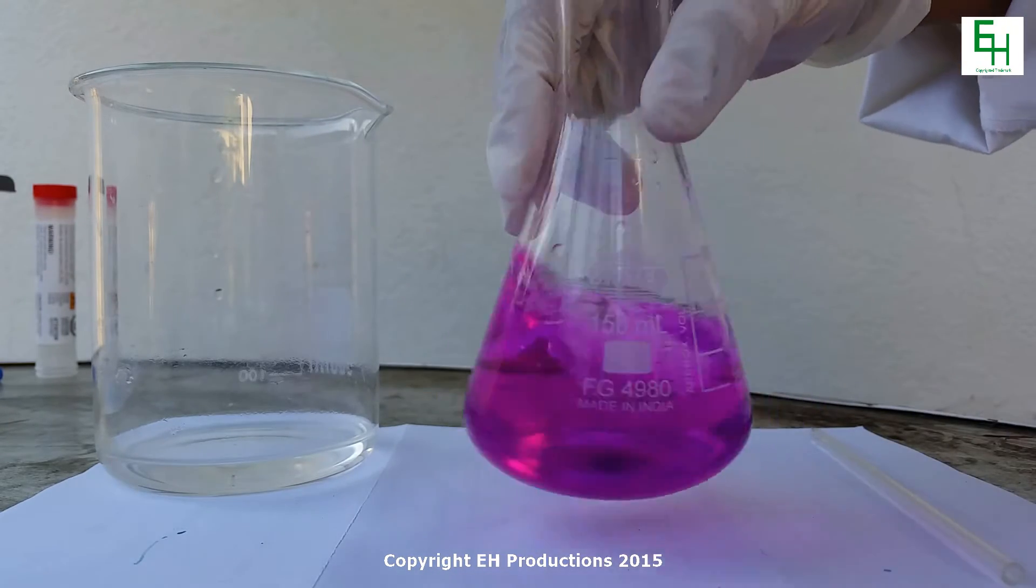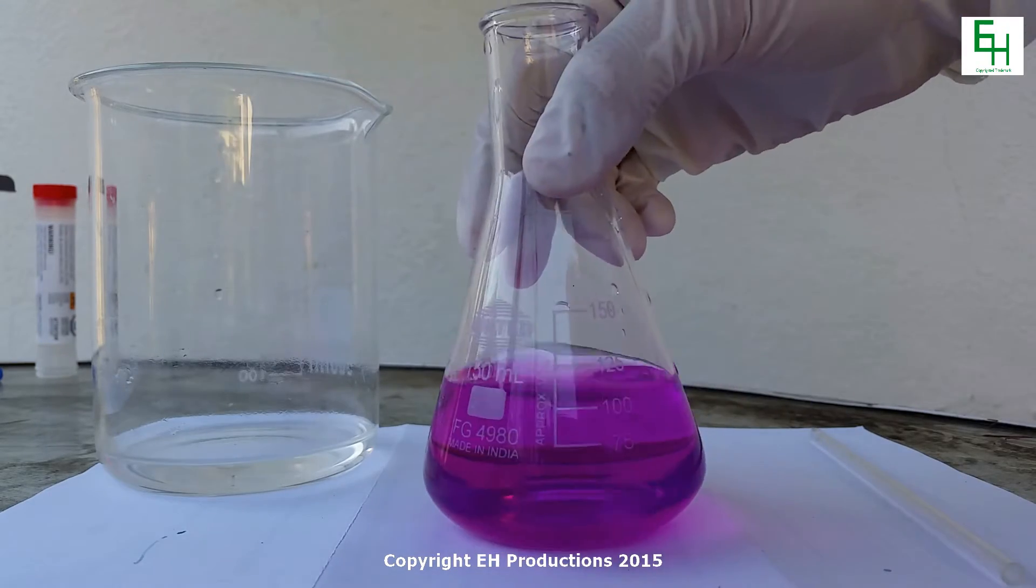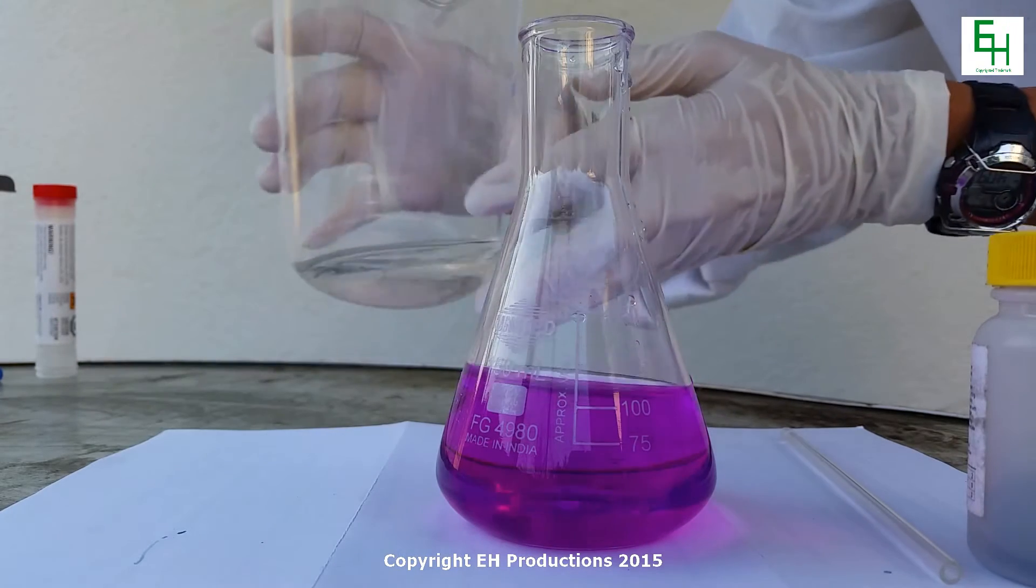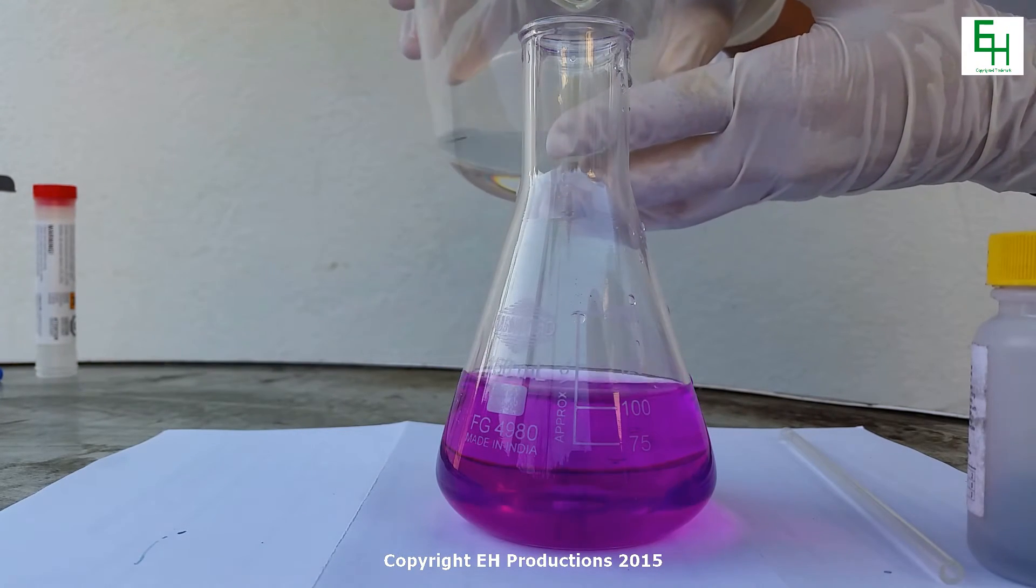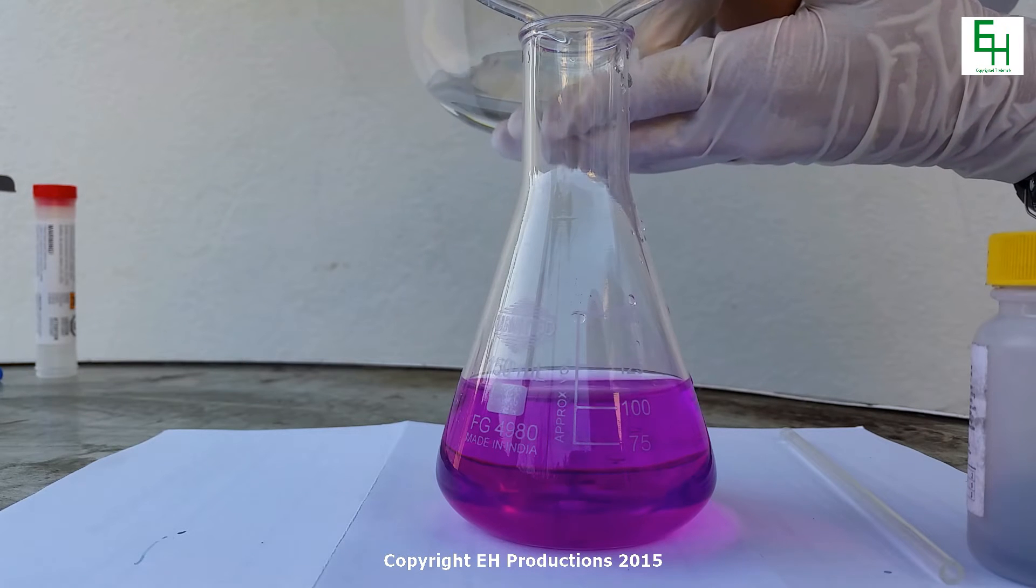Mix it all up and we have a vibrant purple color. Next we're going to pour in our sugar and sodium hydroxide solution and we'll see what happens. Here we go.